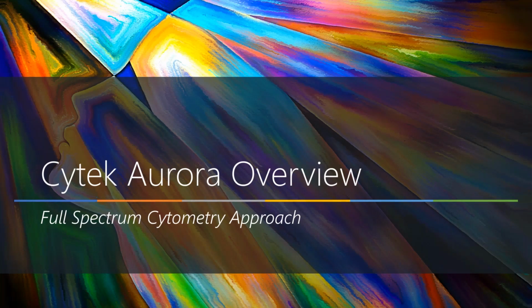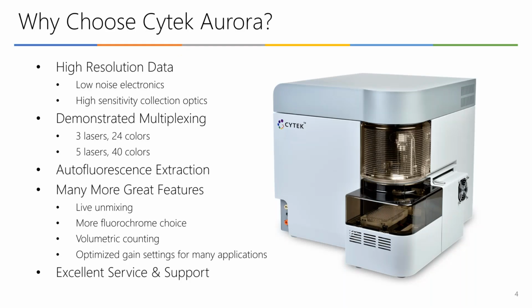High quality data means that all your populations are easily resolved, especially rare subsets or markers with dim expressions. You want to make sure the photons emitted by fluorochromes, fluorescent proteins, or dyes are efficiently captured and resolved from noise or background on your cytometer. The Cytek Aurora instrument definitely provides very well-resolved high-dimensional data using the same operational principles as any other flow cytometer with some optical and fluidics improvements.